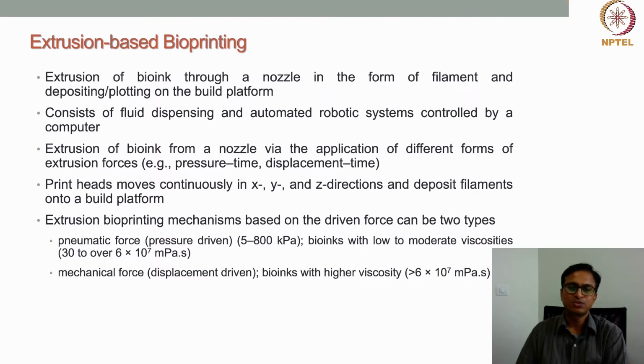The second case is where it is mechanical force driven, like displacement driven, where we apply mechanical force for extruding the material. In this case, very high viscosity bioink, almost more than 6 times 10 to the 7 millipascal second, can be extruded. So there are different types of extrusion based bioprinters available. Some work on pneumatic force, and some work on mechanical force.